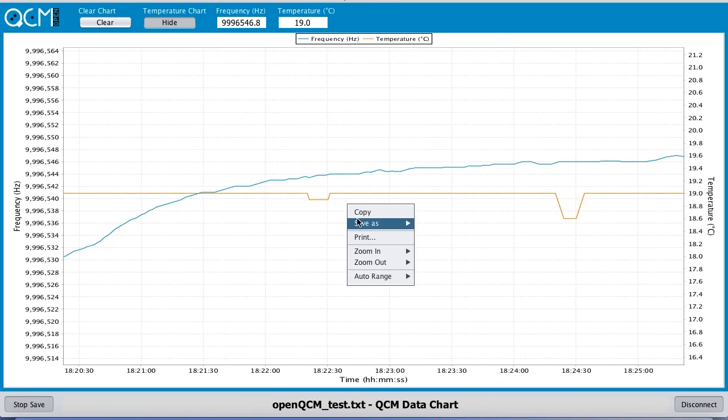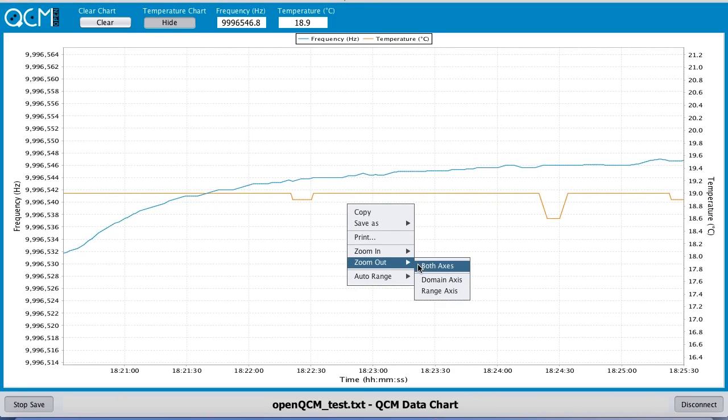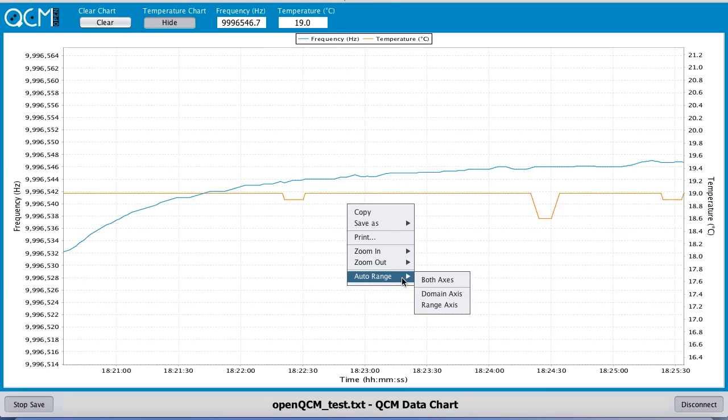Right click on the chart. The chart is interactive and provides several features such as save image, zoom in and out, and auto range axis.